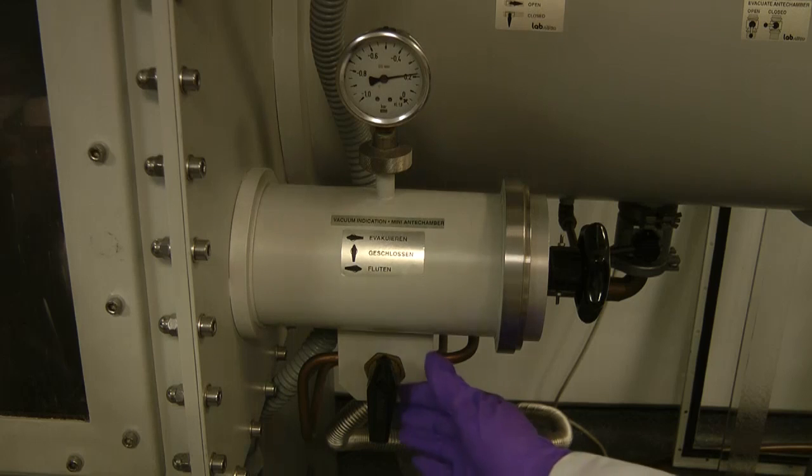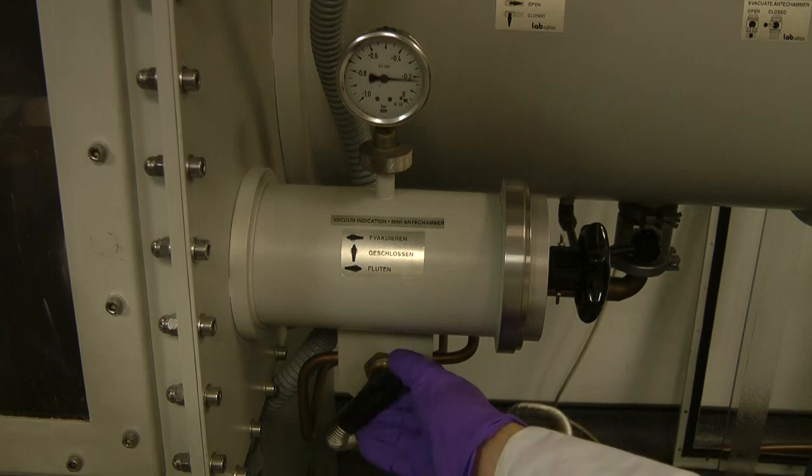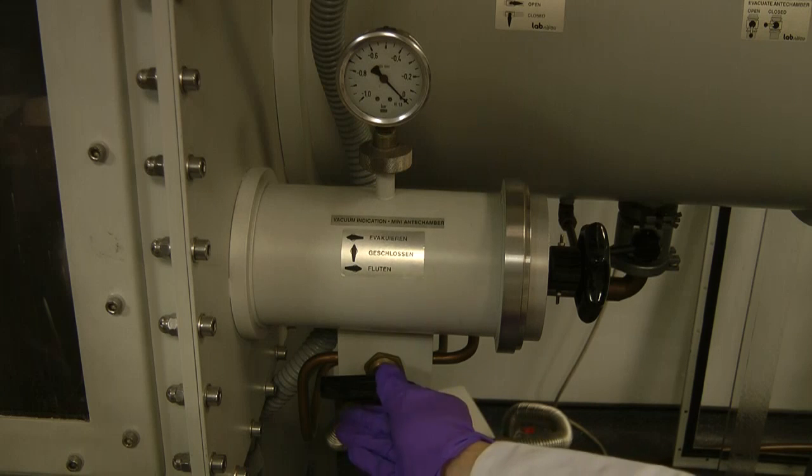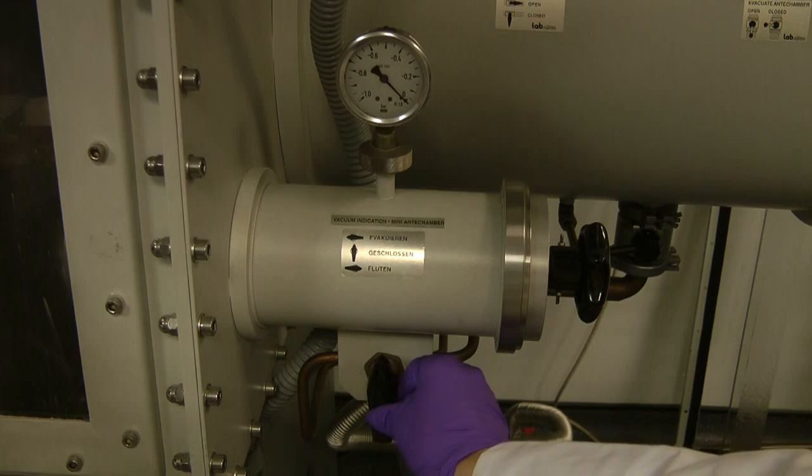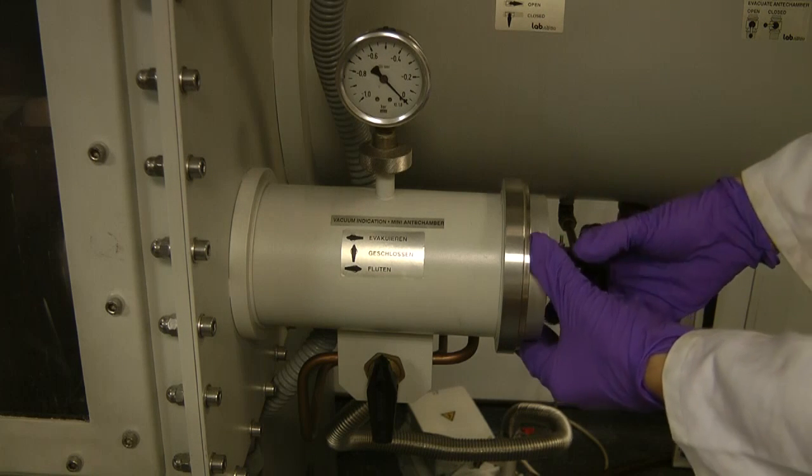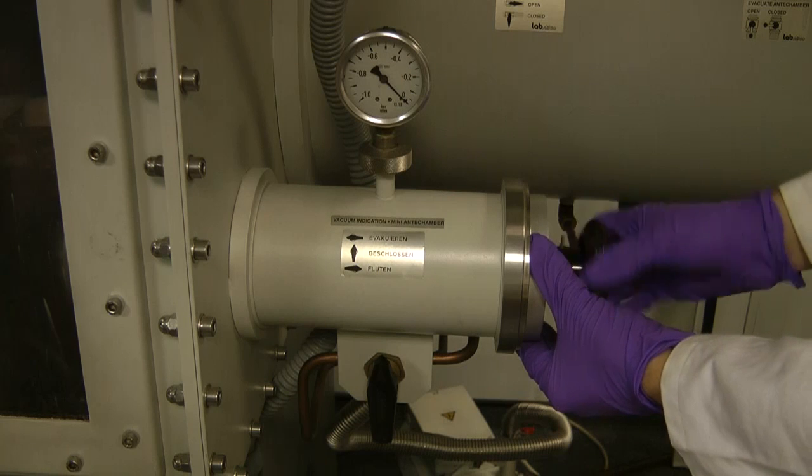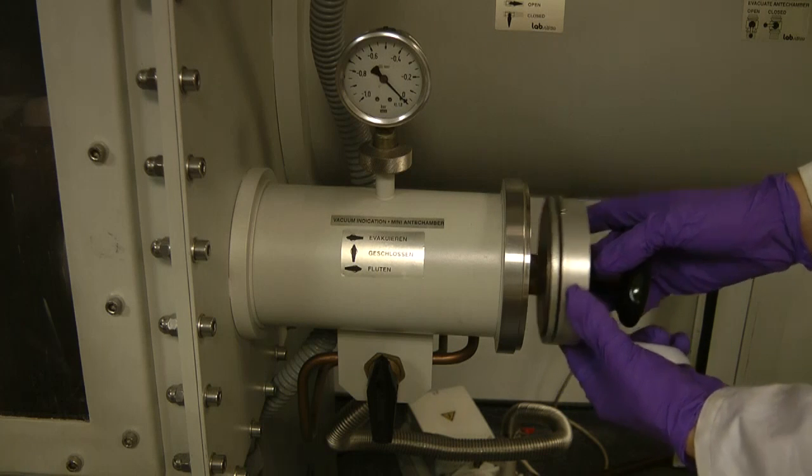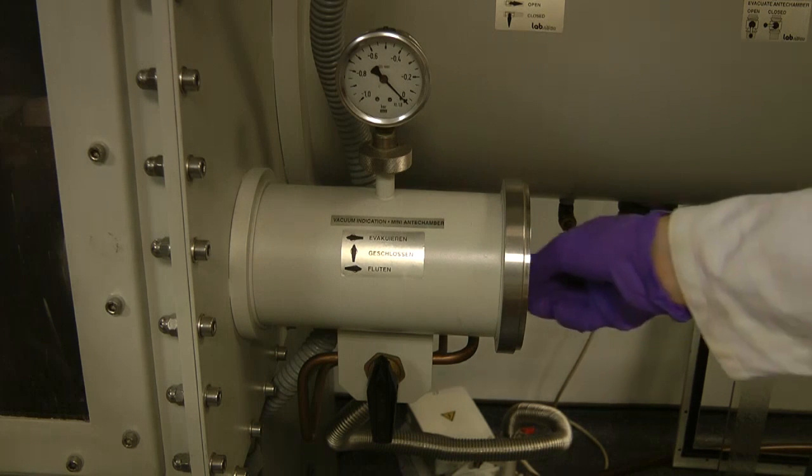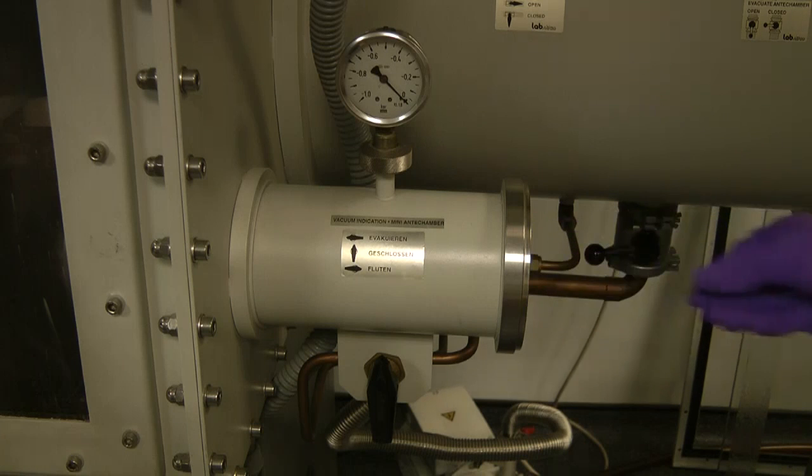To use the anti-chamber, first ensure the pressure gauge reads room pressure, or zero. Then ensure the valve is closed. Open the anti-chamber by unscrewing and twisting anti-clockwise. Place the items to be put into the glove box inside the anti-chamber.